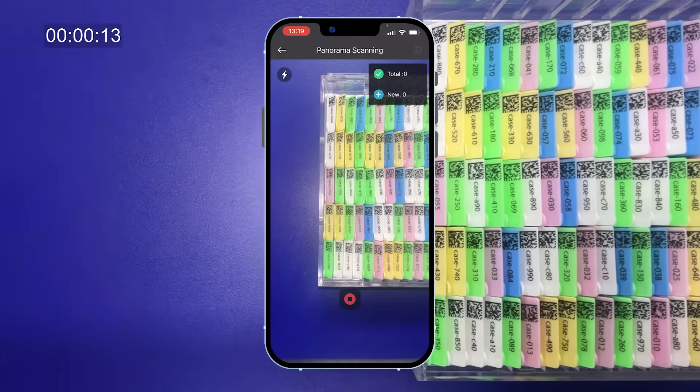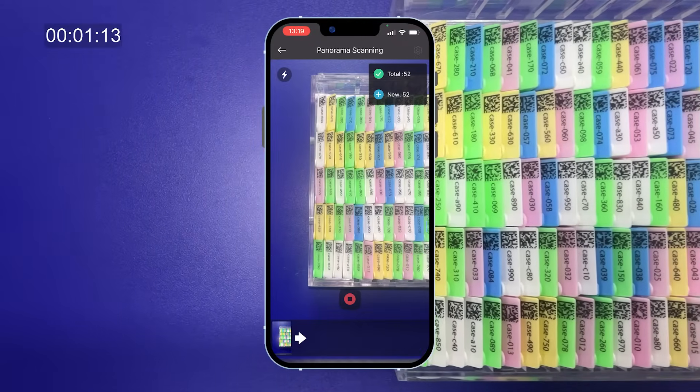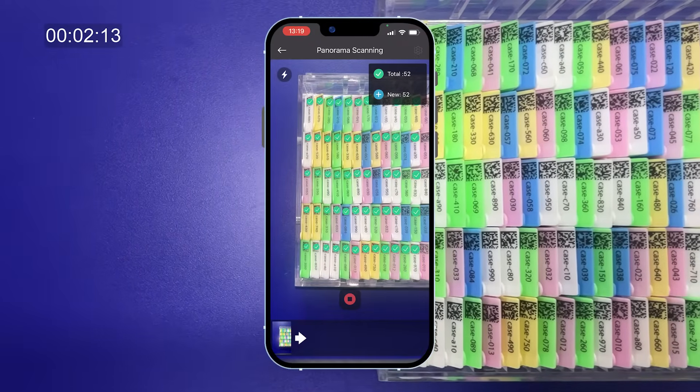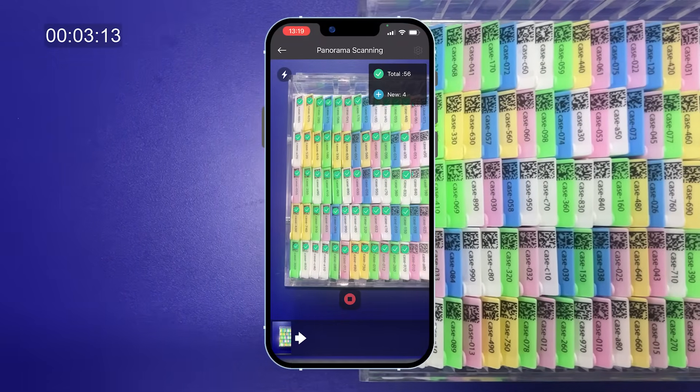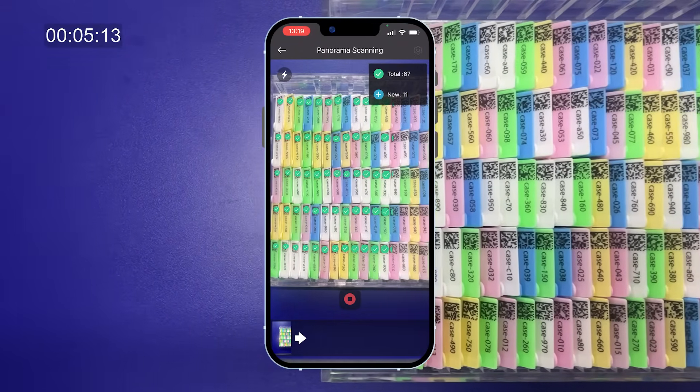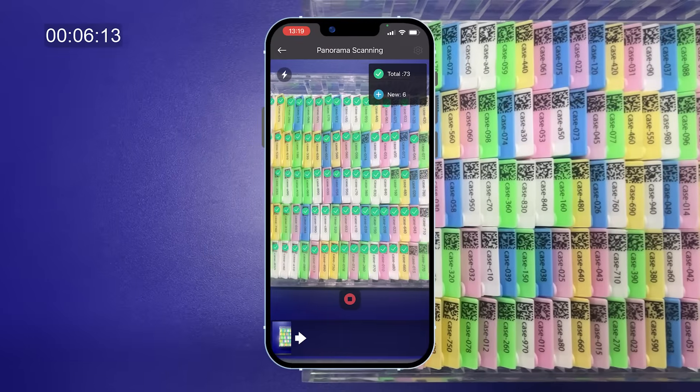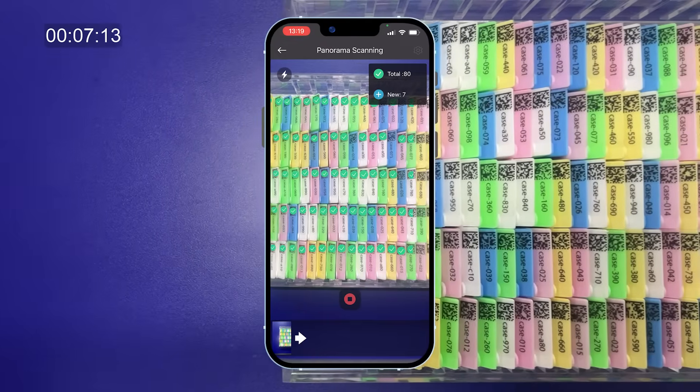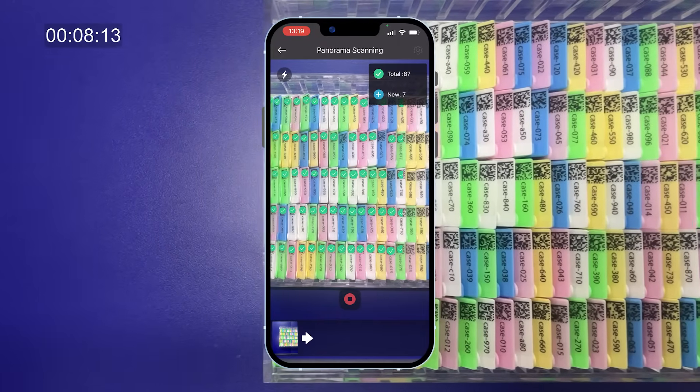Typically, 150 cassettes are packed in a box, each with a small angled data matrix code. Some have deep-colored backgrounds, making localization challenging.